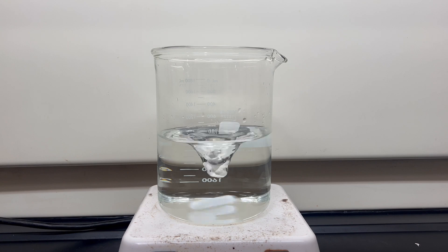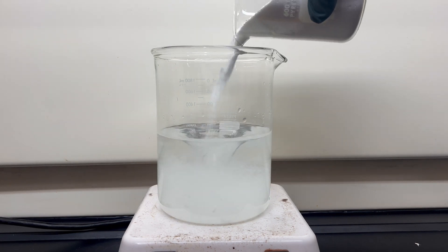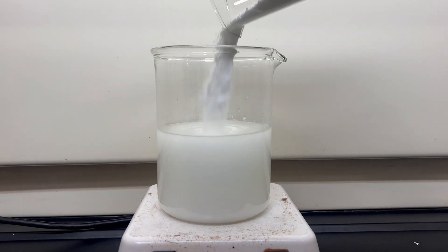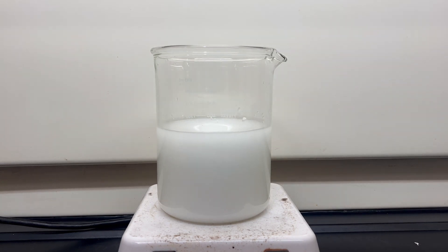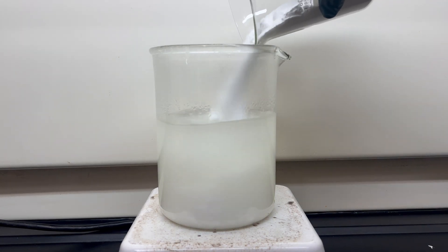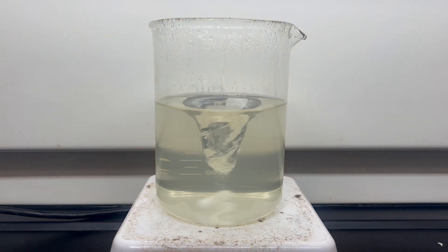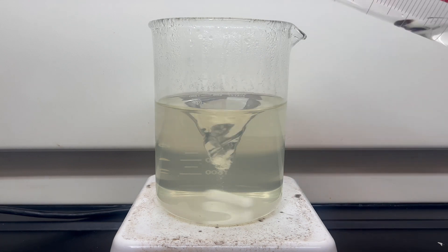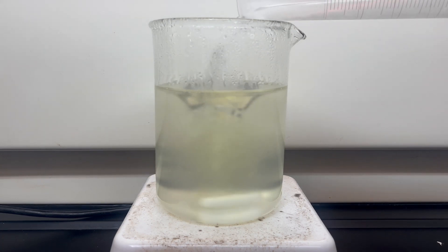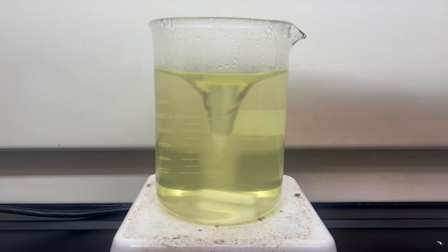I begin by weighing out 500 grams of borax. I then dissolve the borax in 1000 milliliters of distilled water with the help of heating from a hot plate. Borax is quite soluble in boiling water. I add the borax slowly to not bog down the stir bar. Once fully dissolved, I then add in 315 milliliters of 32% hydrochloric acid. Adding the acid creates boric acid, sodium chloride, and water.